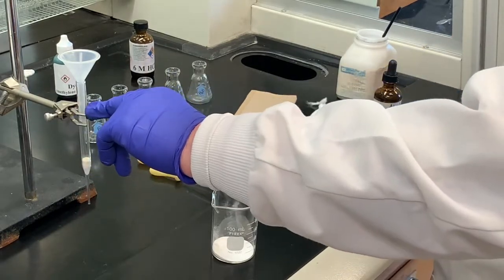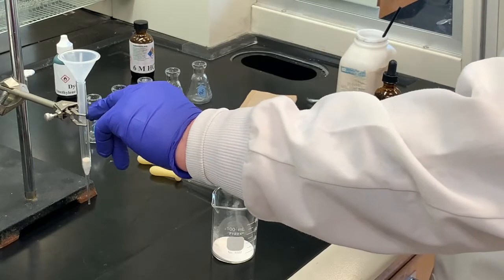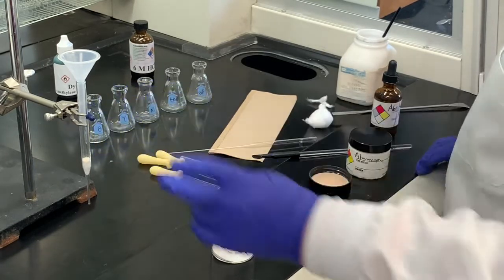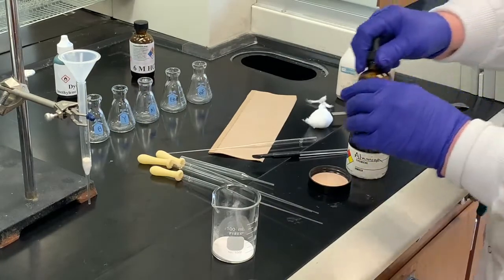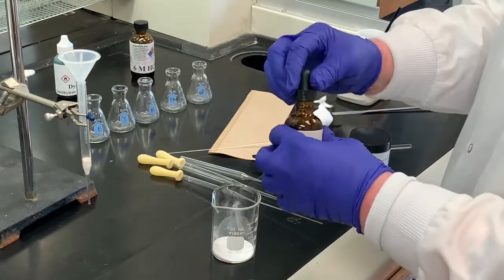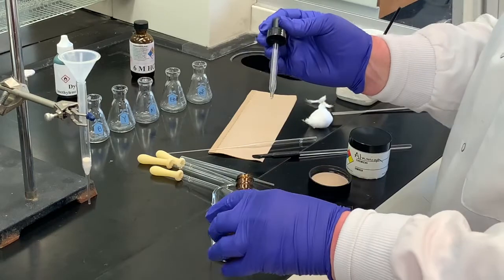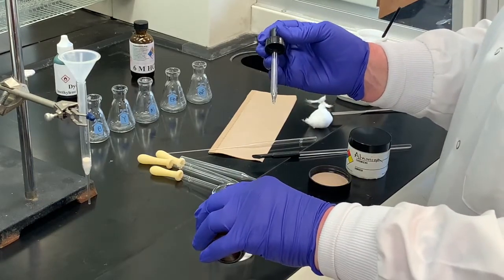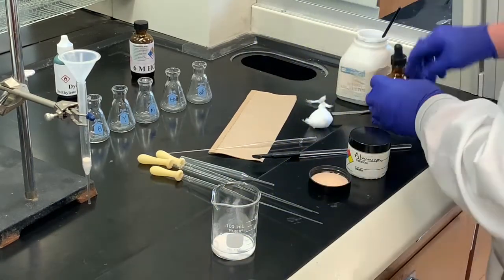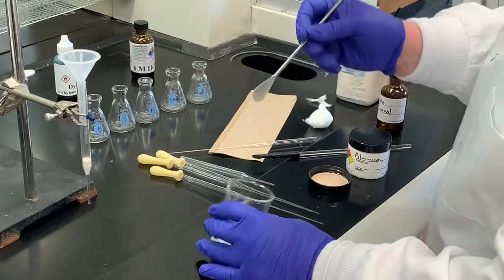We're not going to fill it all the way to the top. We'll probably go somewhere between half full to two thirds full. So I want to add the ethanol. And I just want to add enough that we can have a slurry. If it's too thin, I'll add a little bit more of the alumina.